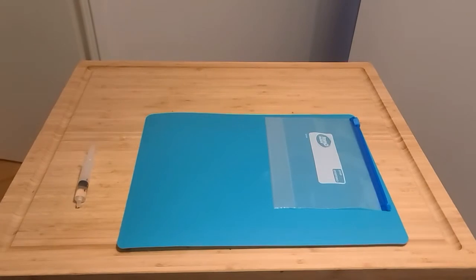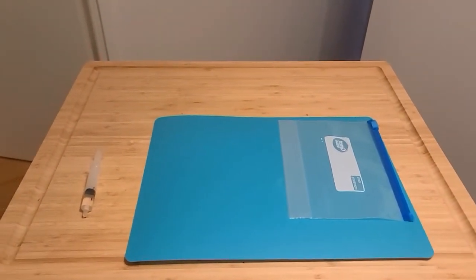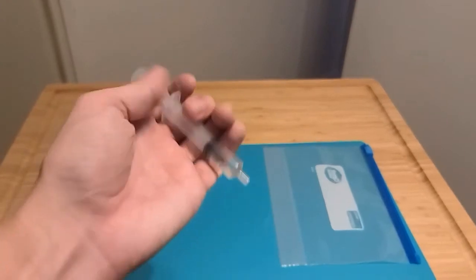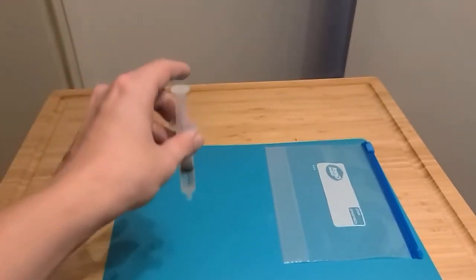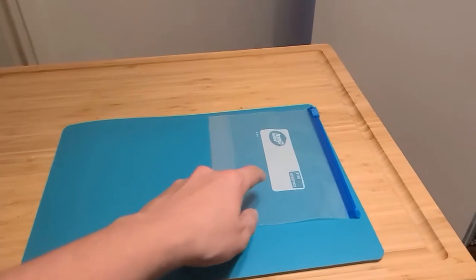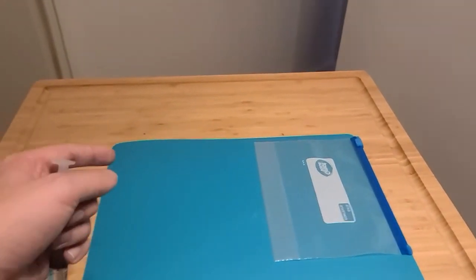Okay, so for the second step, we're going to compare the critical surface tension using the Zisman plot. To do that, I need to make contact angle measurements. The idea is I'm going to take the syringe and do a sessile drop onto each surface, the cutting board being the high density polyethylene, and the Ziploc bag being low density polyethylene. Hopefully I can see a difference between the two critical surface tensions.